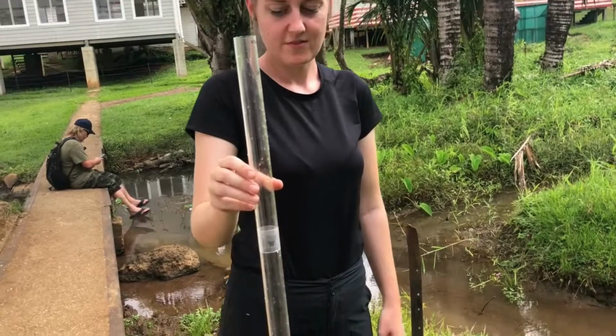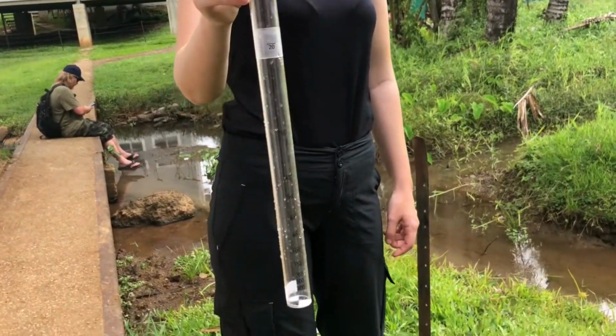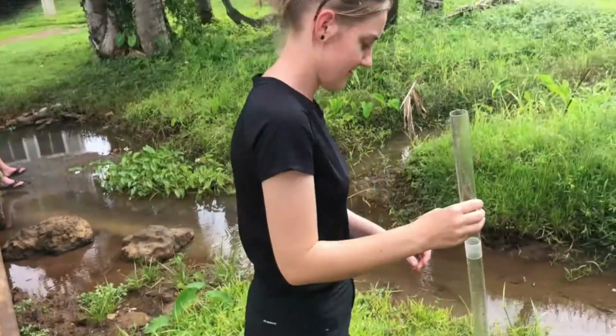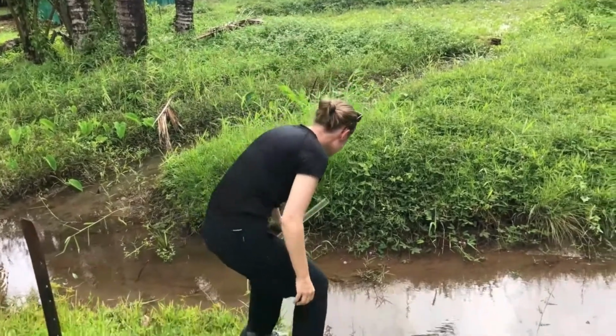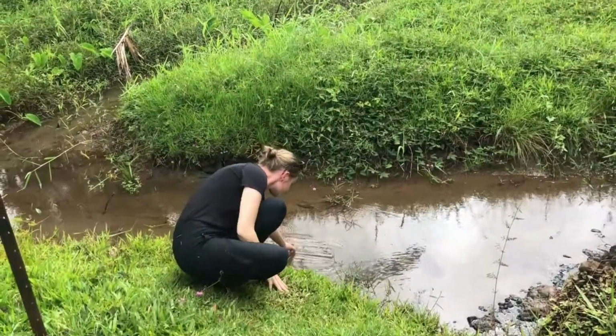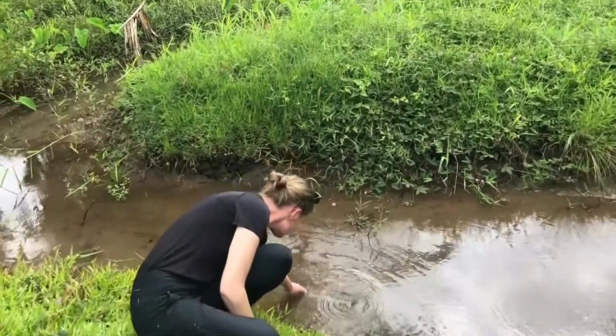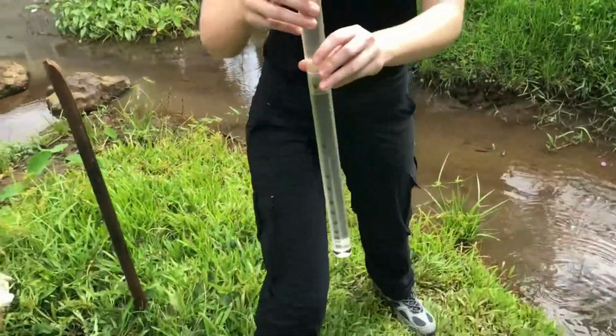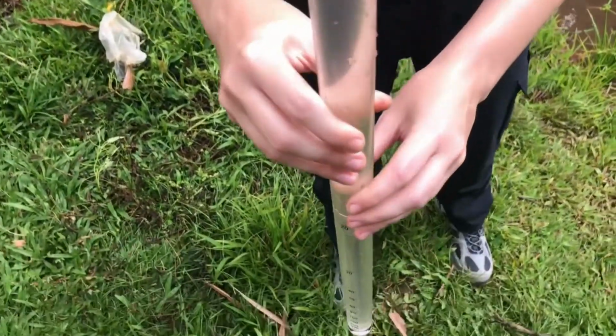This is a turbidity tube used to measure how dirty the water is. Inside at the bottom is a black and white disc, which we look at from above through the water to determine how dirty the water is. We fill up the tube all the way to the top. We look inside from the top. If we can't see the disc, then we pour it out slowly until we can.